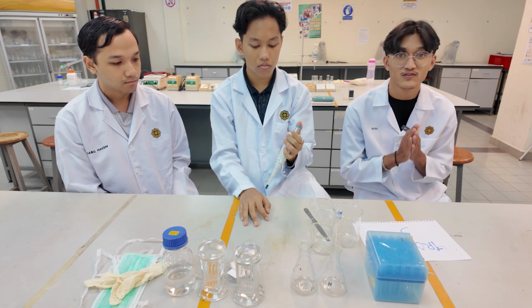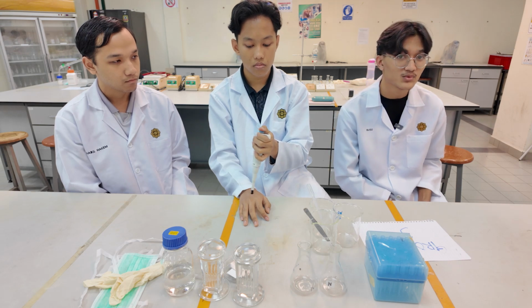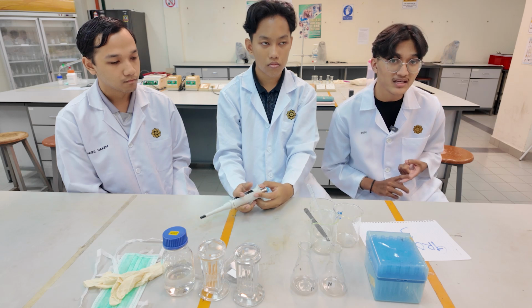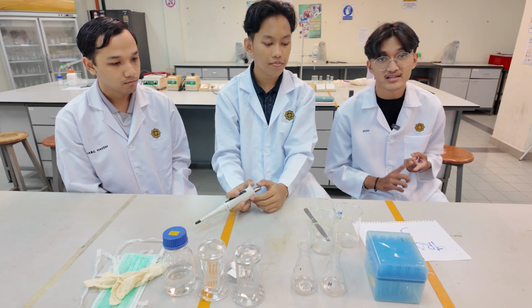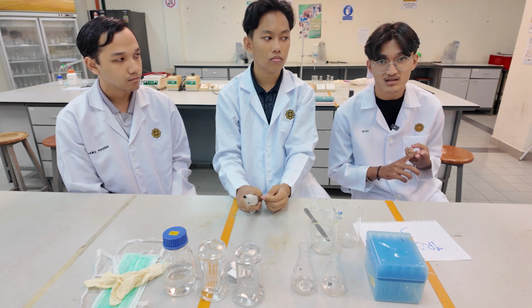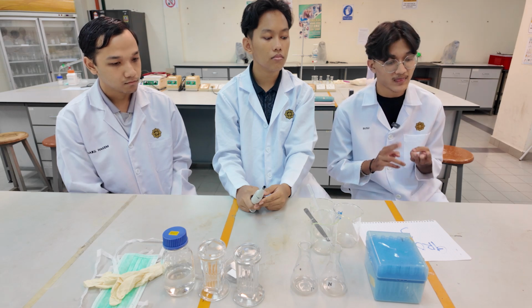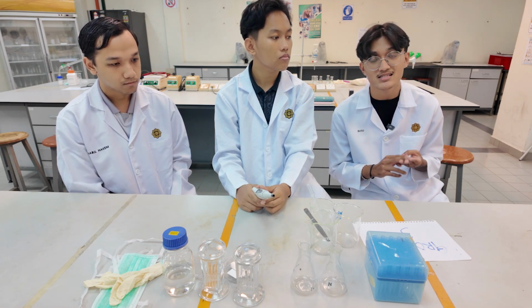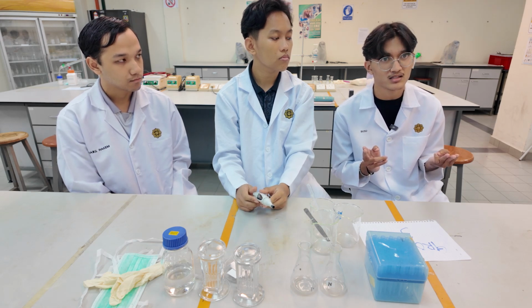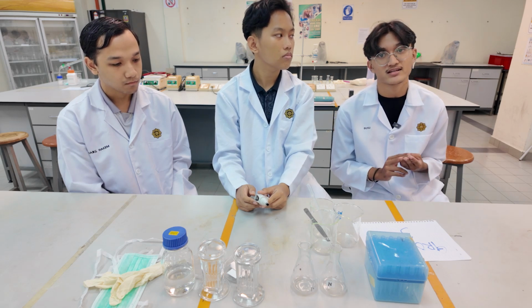And then we move to the advantages of this in the industry. For advantages, the first reason why we use TLC in the industry is because it is cheap. It requires minimal equipment and ingredients to do the TLC. The next one is fast, because we can achieve the result of TLC within minutes to hours. And the final one is easy to use, because normal people, like the normal technician, also can use this TLC method without any advanced training needed.